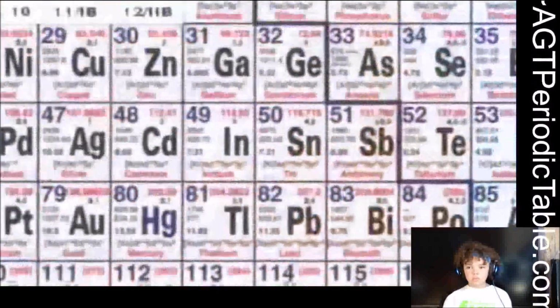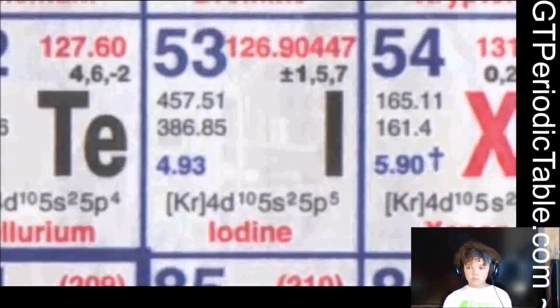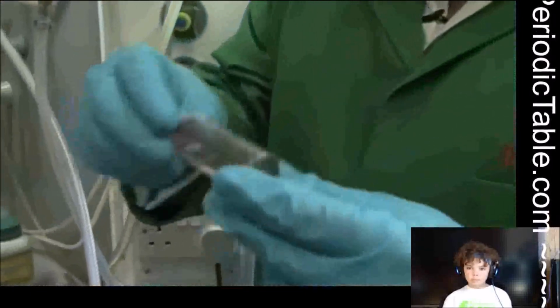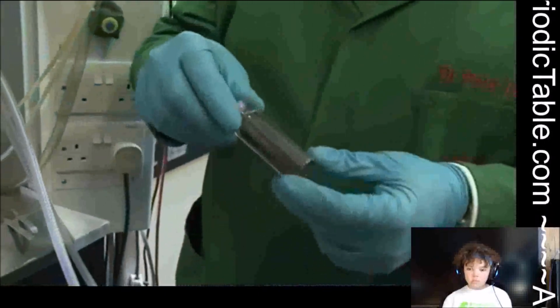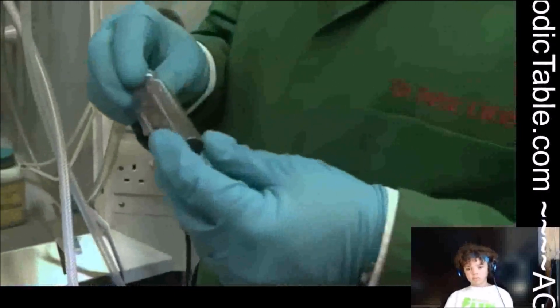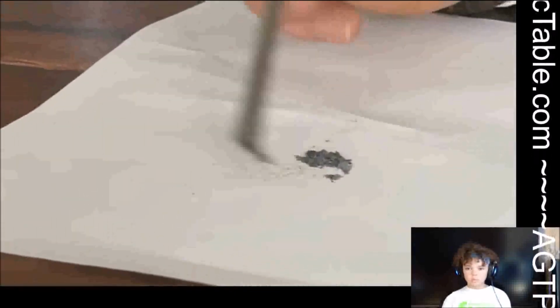Iodine is a halogen element from the far right-hand side of the periodic table, and it's strongly oxidizing in nature. It likes to nick electrons off other atoms. So what we're going to do is a reaction with iodine, and today we've ground some iodine, so it's normally found from chemical suppliers as really nice large crystals. But what we want to do is a reaction where we need to make sure that the surface area of the iodine is really, really large, so that all of it can react very, very quickly with the other component.